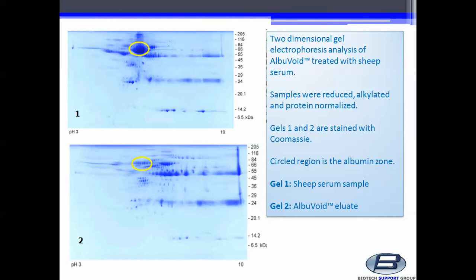Gel 1 displays the Sheep Serum sample. Gel 2 displays the Albuvoid eluate.